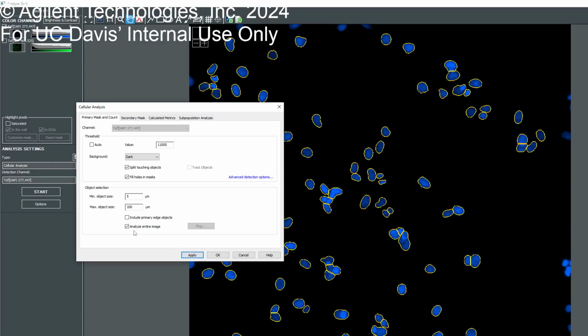The next thing you can look at is the size. For sure, these fibroblast cells are not going to have nuclei of like 100 microns. We know that for sure, right? So how can you determine the lowest point and the highest point? You can look at the average size here, which is like 17 microns. Just from experience, you would also know what would be a good starting point. So I just double that number approximately and use a 40 micron threshold. Now if I have a huge debris of 100 microns, it's not going to count that as a nucleus. So that's good.